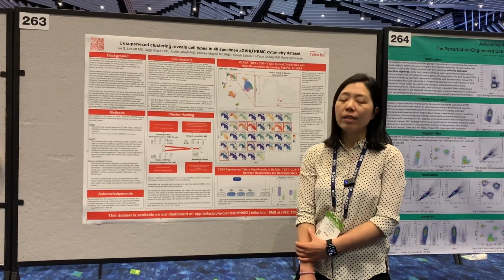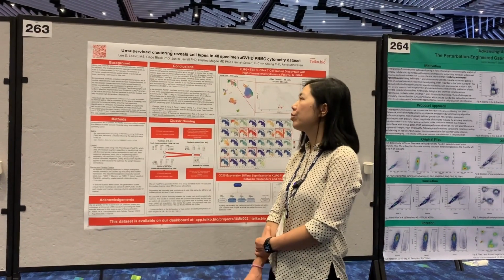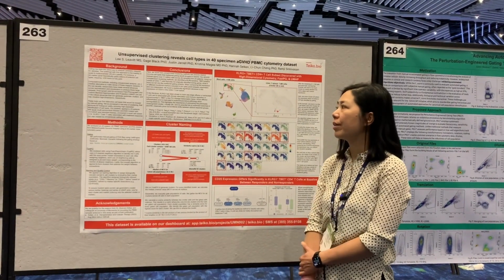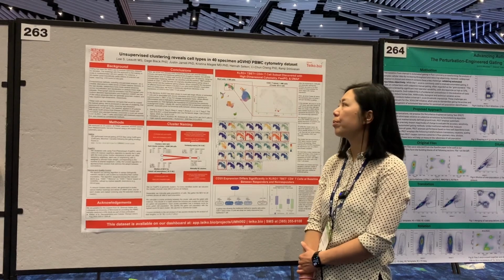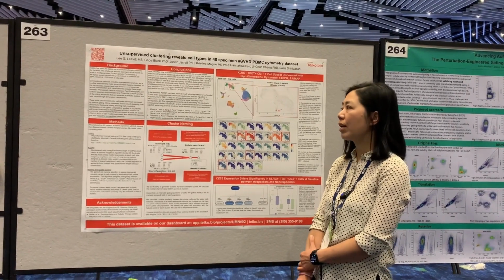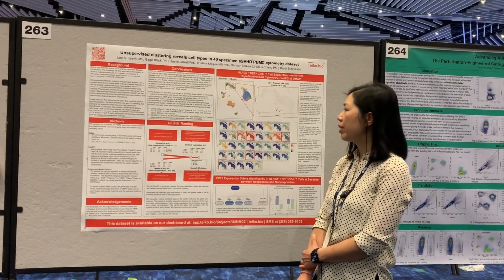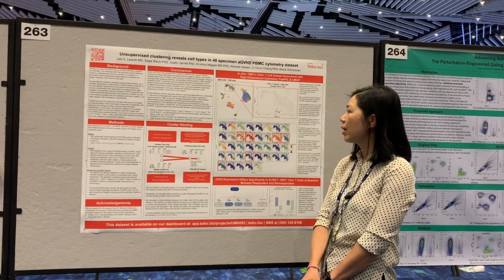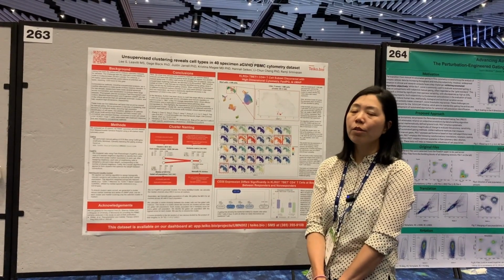To overcome that, computational approaches, including unsupervised clustering analysis, have been used by many groups as an alternative to analyze high-dimensional cytometry datasets.